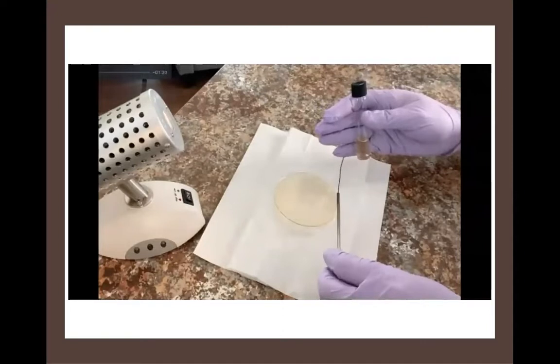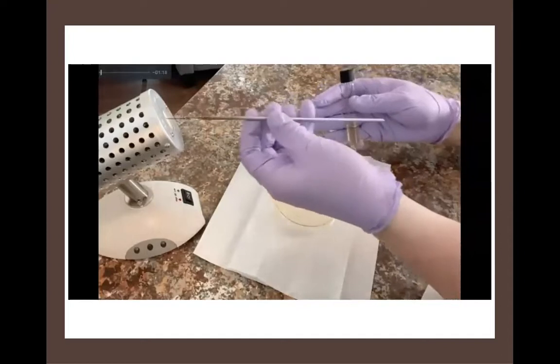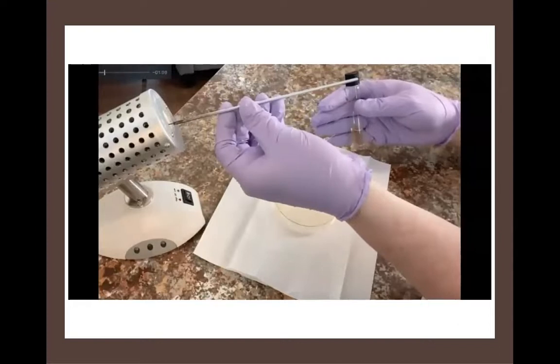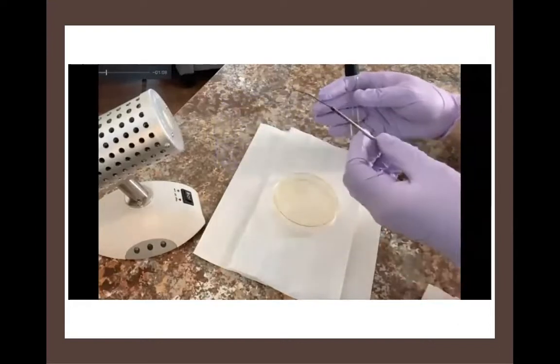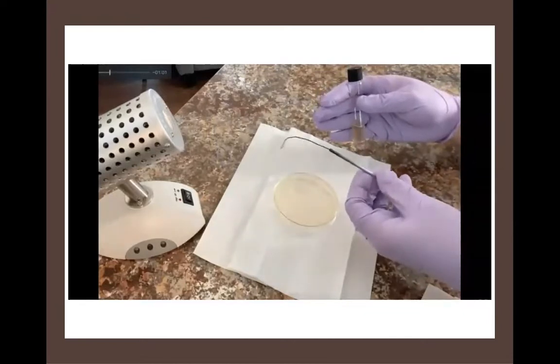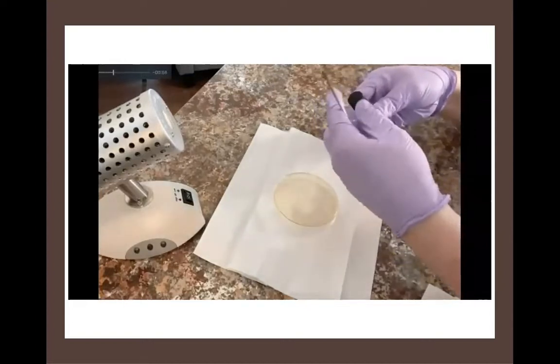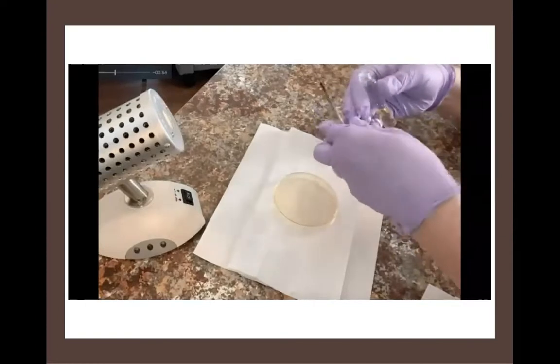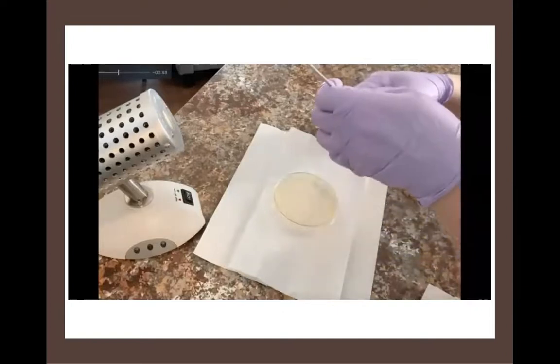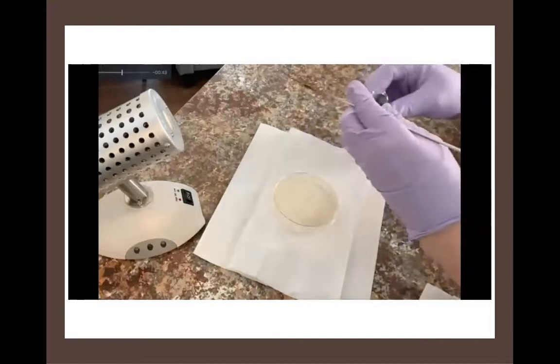It really depends on the person handling the loop. But once you bend it into place, you can still get it into the incinerator bent because it's very flexible. It's a wire. So you would heat up the wire just as you always would. See, the bend is still in it. You're going to let it cool. If you have it bent as severely as I do here, once you open up your culture, which I'm doing here, just going to want to be very careful as you introduce the loop. Again, you don't want to touch the neck of the tube. Take out some of your culture material, close your culture.